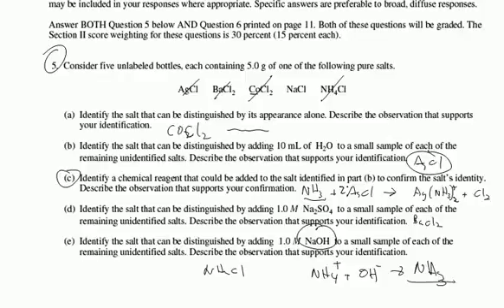So adding ammonia to silver chloride produces this complex ion of silver and ammonia. Notice it's got that positive charge, and that's what allows it to dissolve. I believe that this is going to be 2 Cl minuses here.